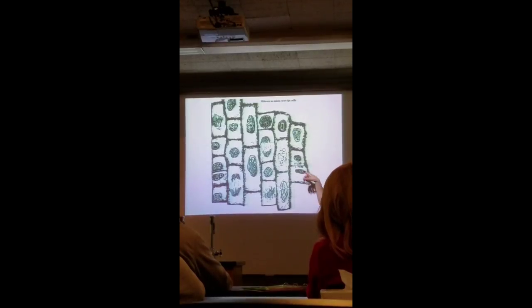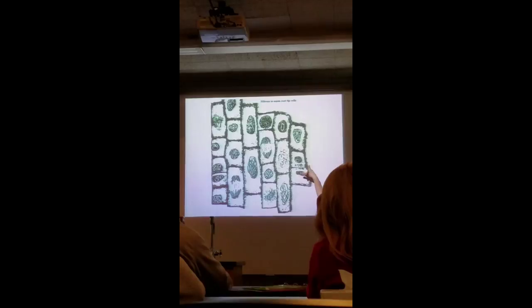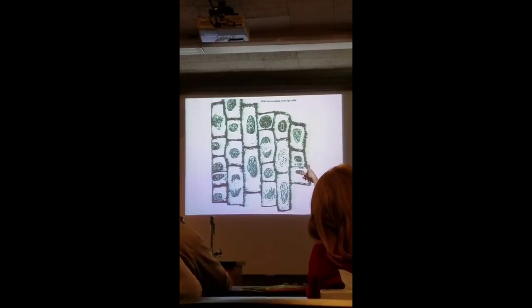Yeah, so if I ask you some of these, I'll make sure it's very clear. Remember I said that the beginnings and ends are kind of arbitrary, little fuzzy gray areas. This is really telophase is over. You can see these dictyosomes are laying down this, so this is really cytokinesis. That wall's being built. Although this starts at the end of telophase, I'm going into the beginning.